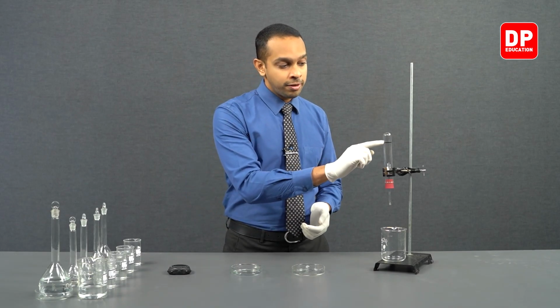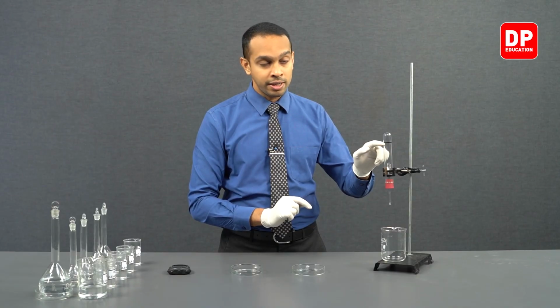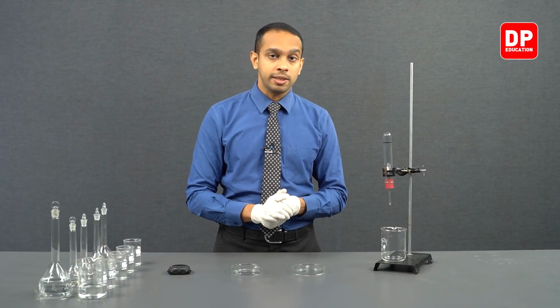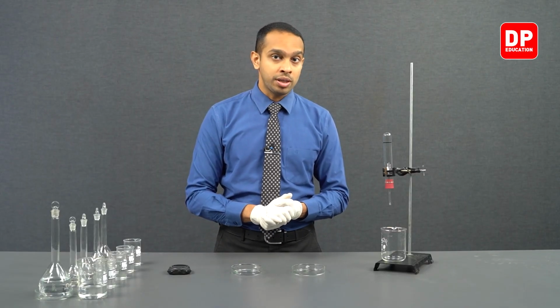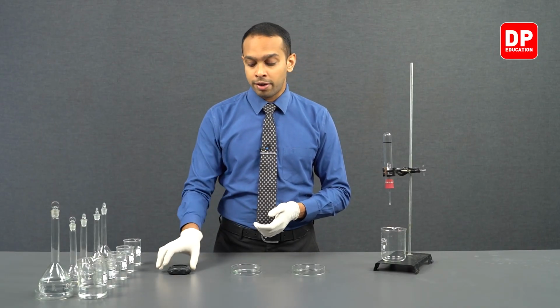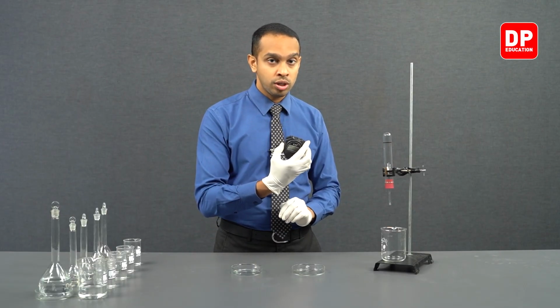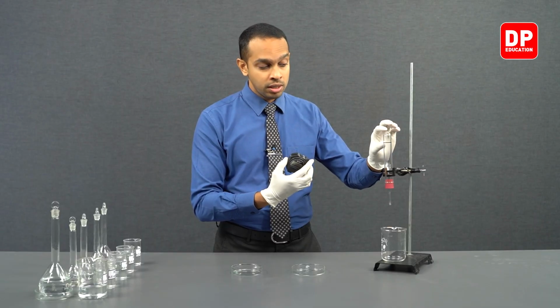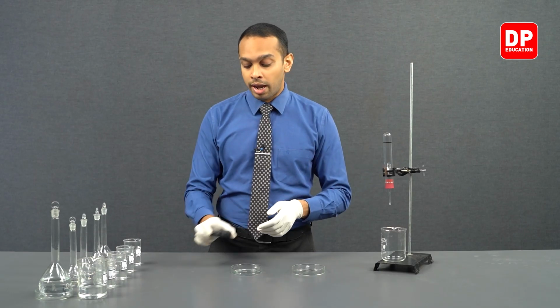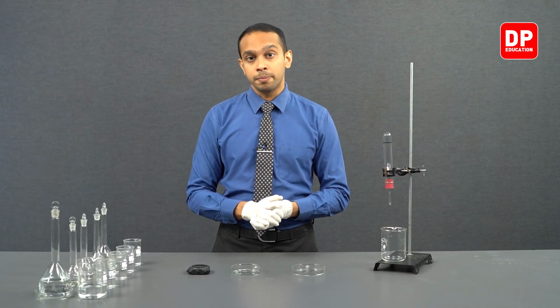As soon as we have a constant volume, marked by this black line that we have over here, as soon as we have collected a constant volume of hydrogen gas, we will be measuring the time that it took to collect this amount of hydrogen gas. I may have forgotten to mention, as soon as we turn this tube upside down, we will be starting the stopwatch, and as soon as we have collected this specific volume of hydrogen gas, we will be stopping the stopwatch and observing how long it took for this hydrogen gas to get collected.